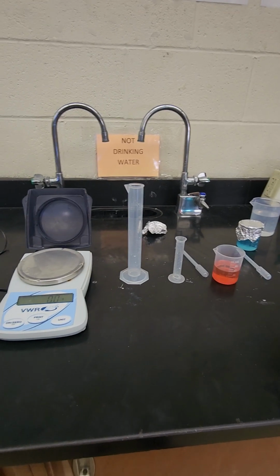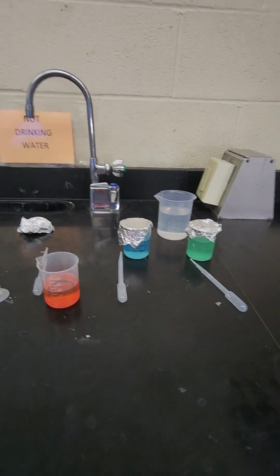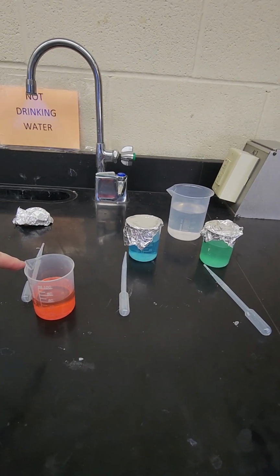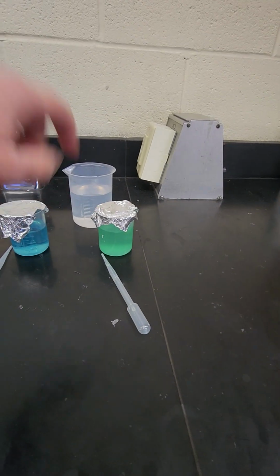So today we're doing the determining density lab, and we're going to determine the density of 3 different liquids. The red is isopropyl alcohol, the blue is regular water, and the green is salt water.